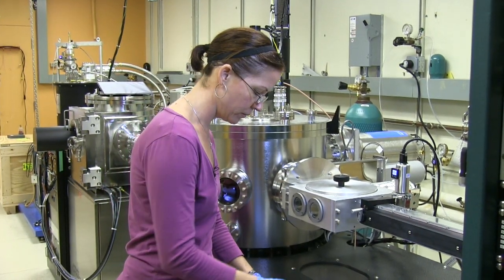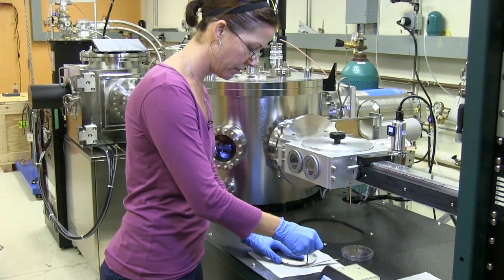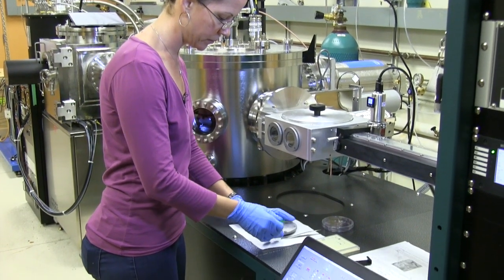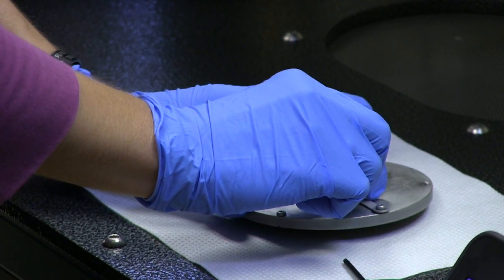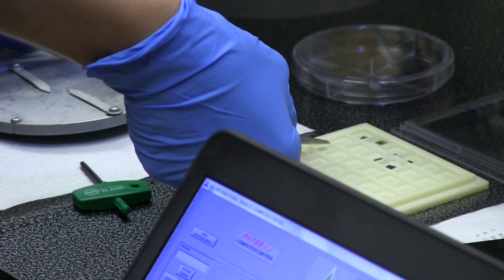All we have to do is loosen up the screws on either side, making sure that the arms don't scratch the sample. And then you just pick it up and put it in the next sample spot.